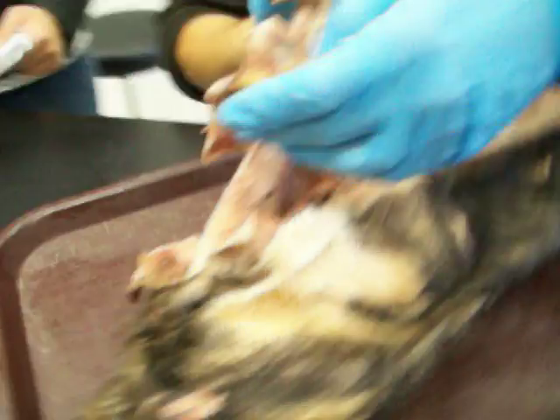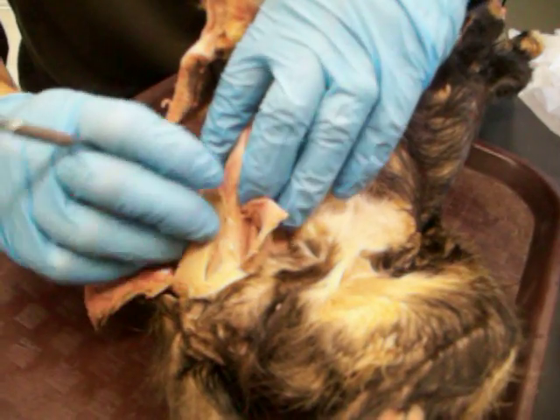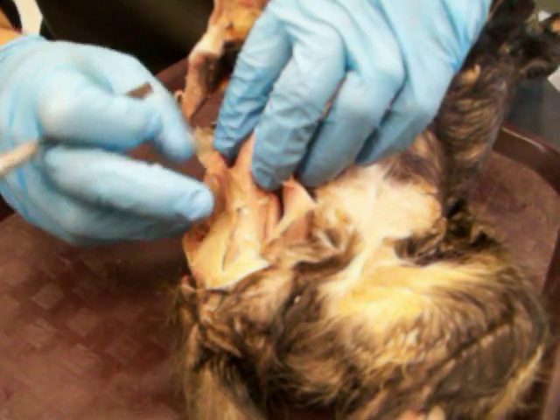Let me just flip it so you can see. Semimembranosus right here. Semitendinosus is cut right next to it — it looks like it would just naturally slide in right there — and the biceps femoris is back there. So these three are the hamstrings.